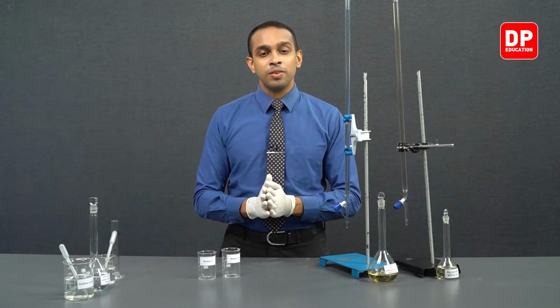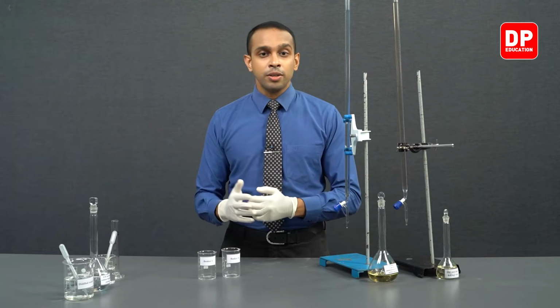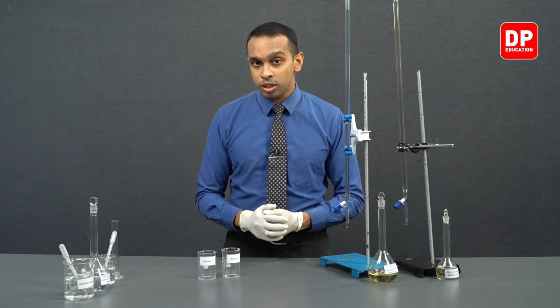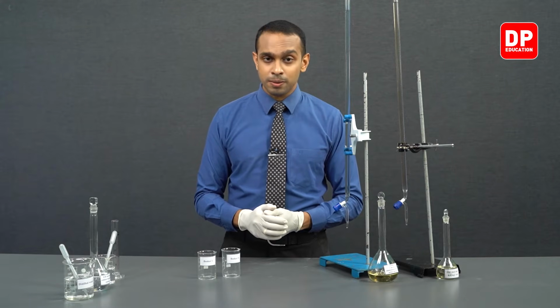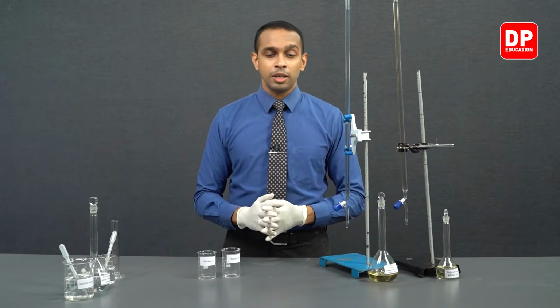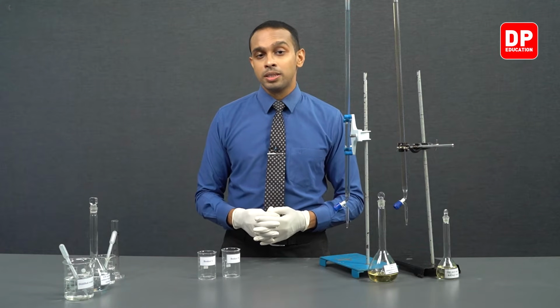So students, when this reaction is taking place, we need to measure the rate of the reaction when we change the concentration of Fe3+ ions. So in the first part of our experiment, we are going to be changing the concentration of Fe3+ ions.